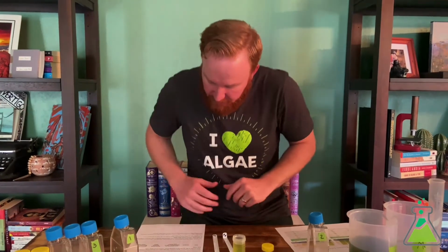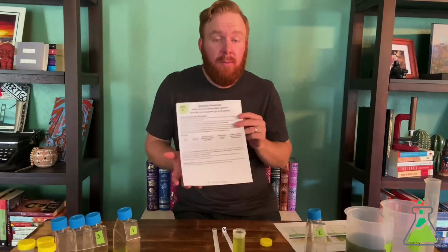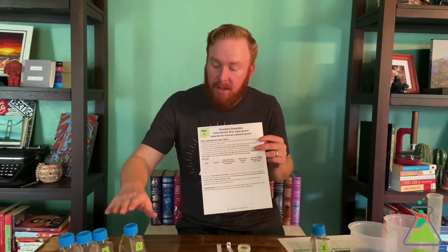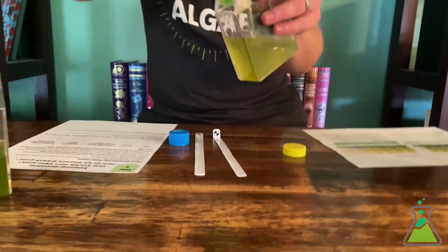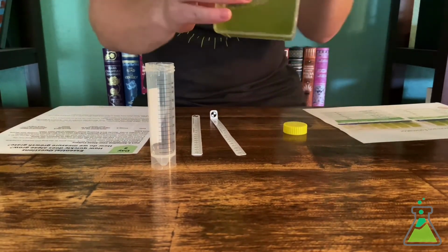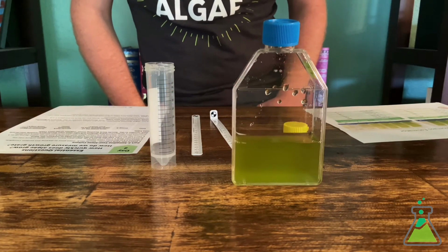And then the next part here is, so now you filled out the table. And then the last part here is our qualitative data. So the measure that we just did with the Secchi stick gave us quantitative data, a number to describe how much algae is actually in the culture. And this next part is qualitative. So using your own observations, explain what your culture looks like today. What color is it? Does it look like something you've seen similarly as well? And so here, I'm going to go ahead and put our algae back in the flask. So we'll just pour this back in. And I'll leave this here for you guys to take a look at. And so you can go ahead and fill in that bottom question for your qualitative data or your observations of your culture.